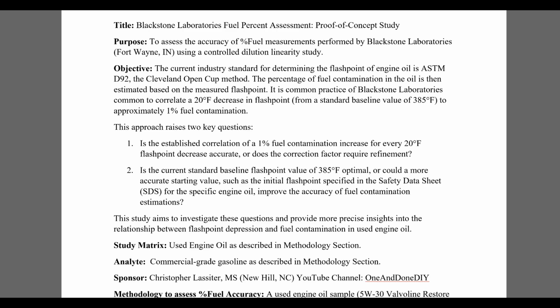But anyway, back to the FTIR. You can't really compare FTIR and the Cleveland Open Cup method because, first of all, FTIR is looking at signatures of actual gasoline molecules on an atomic level. And if you're not familiar with what FTIR is, basically every atom or combination of atoms, such as molecules, absorbs light in a very unique way. So they basically have a different signature under infrared analysis. That's just a simplified version of it.